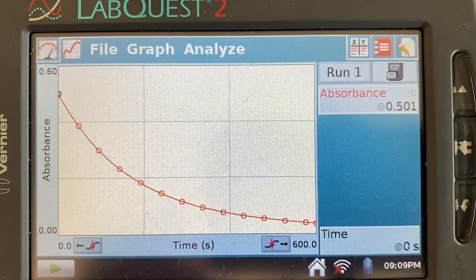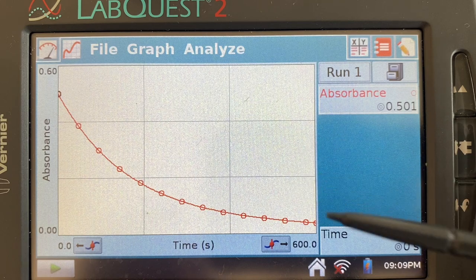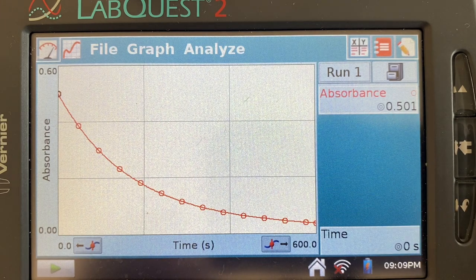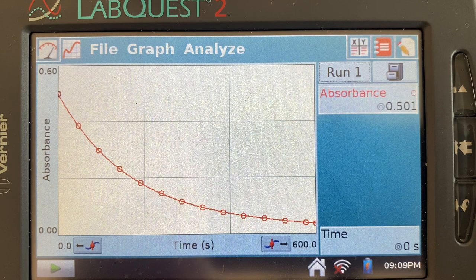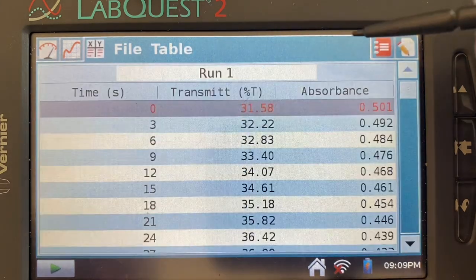Okay, so the concentration versus time data that we're seeing right here is not linear, which indicates that it is not a zero-order reaction. And I want to manipulate this graph to see what order it actually is.